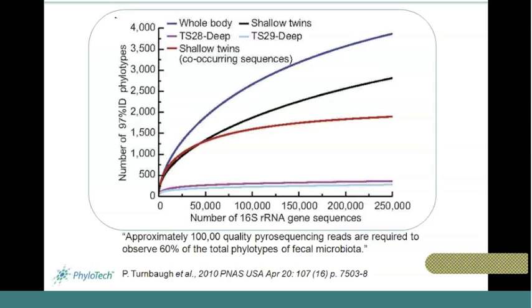And the dynamics of hybridization are such that all of the members are competing equally for the probes in the assay. And so it's not sampling that you're doing. It's detecting everything that has a partner in the assay, that has a complementary DNA probe. And therein lies the sensitivity.